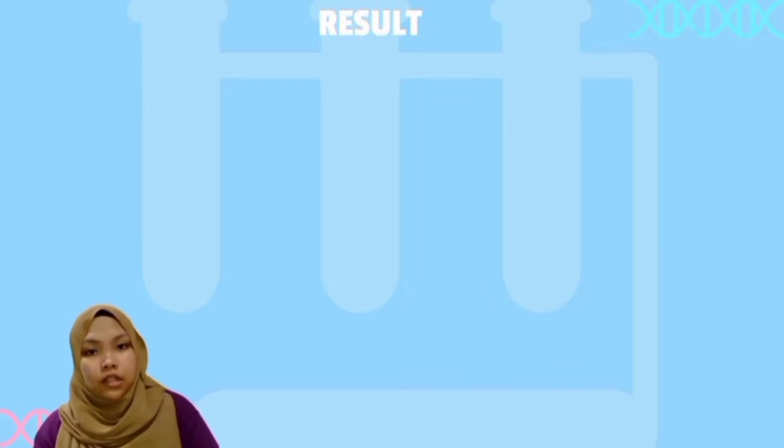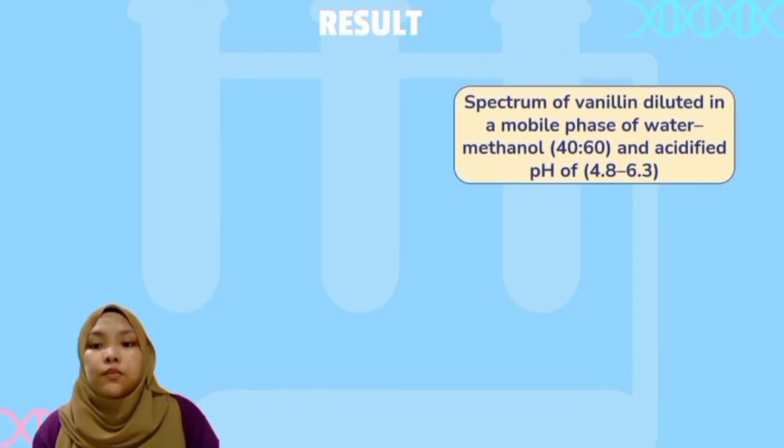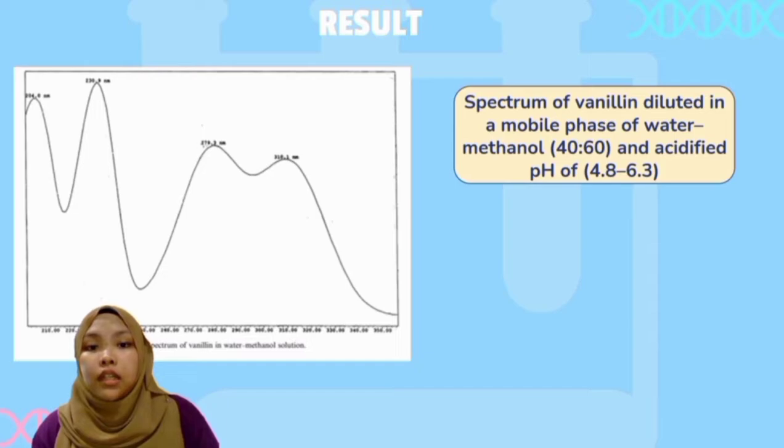Assalamualaikum warahmatullahi wabarakatuh. My name is Amalia Safia binti Sulaiman. In this video, I will be explaining the results. The first one is the spectrum of vanillin diluted in a mobile phase of water-methanol with a ratio of 40-60 and an acidified pH of 4.8 to 6.3.